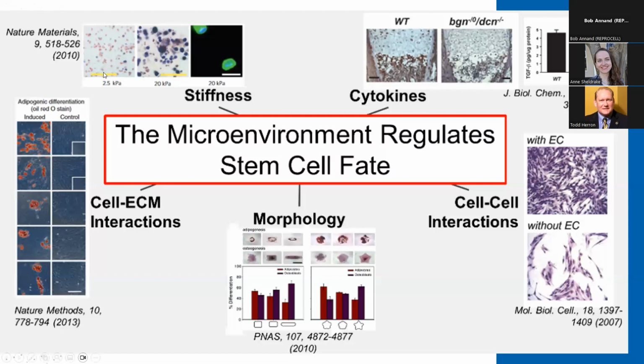But there are many other factors involved in how cells sense stiffness. For example, in this bottom paper here, researchers used cookie cutter-like cutouts to force cells to take on a certain morphology. The stiffness, roughness, and surface chemistry of the surfaces the cells were grown on were identical. It's the shape that the cells were forced to conform to alone that was changed. And under these conditions, cells were seen to start down different differentiation pathways.